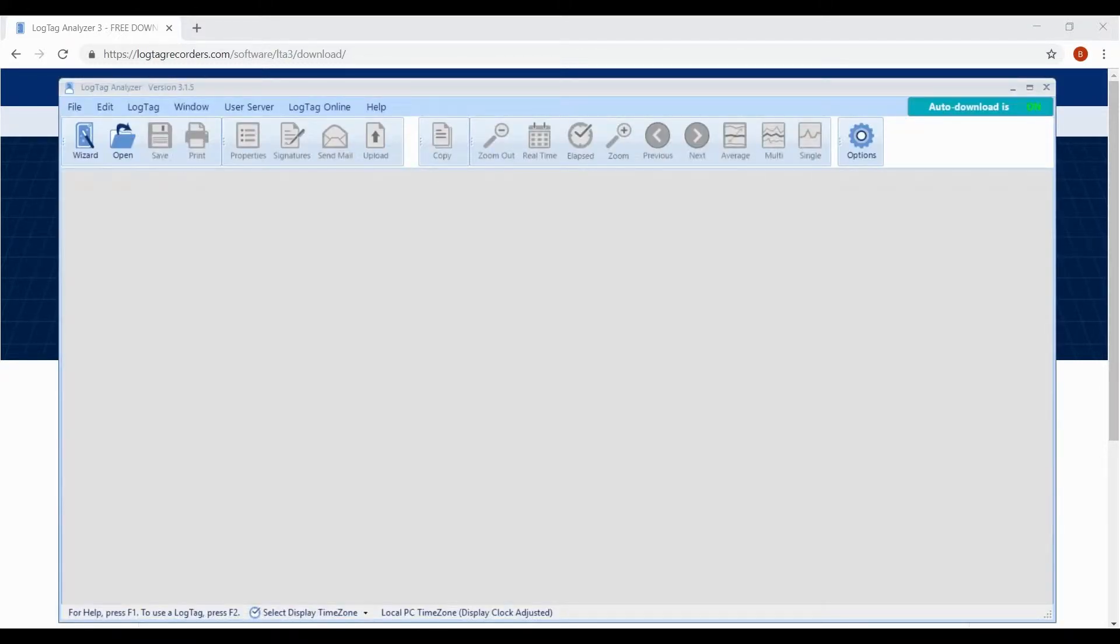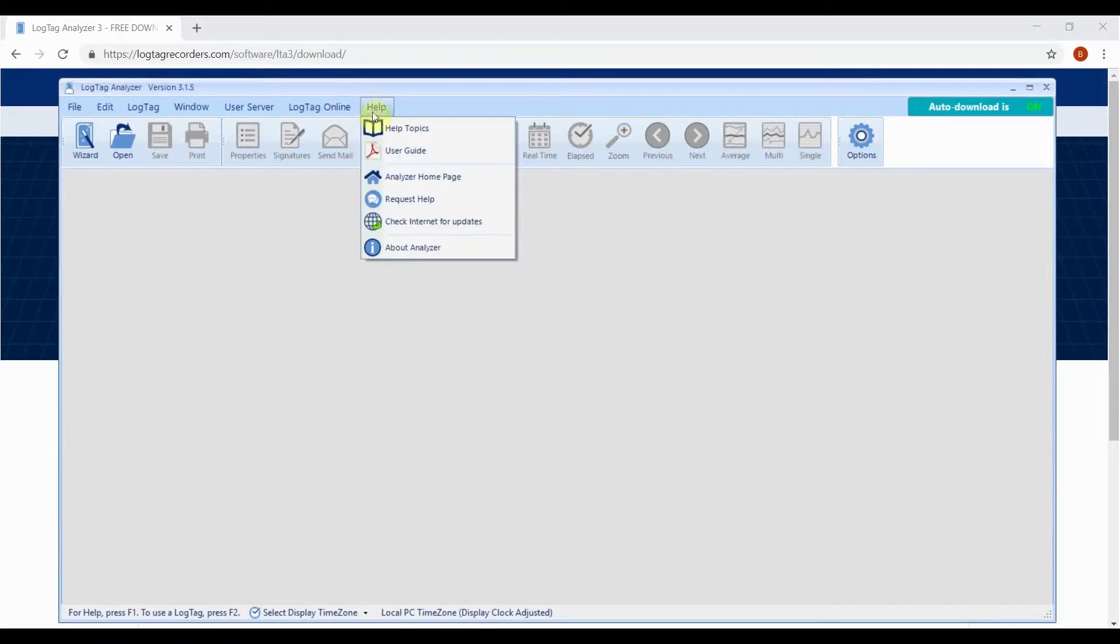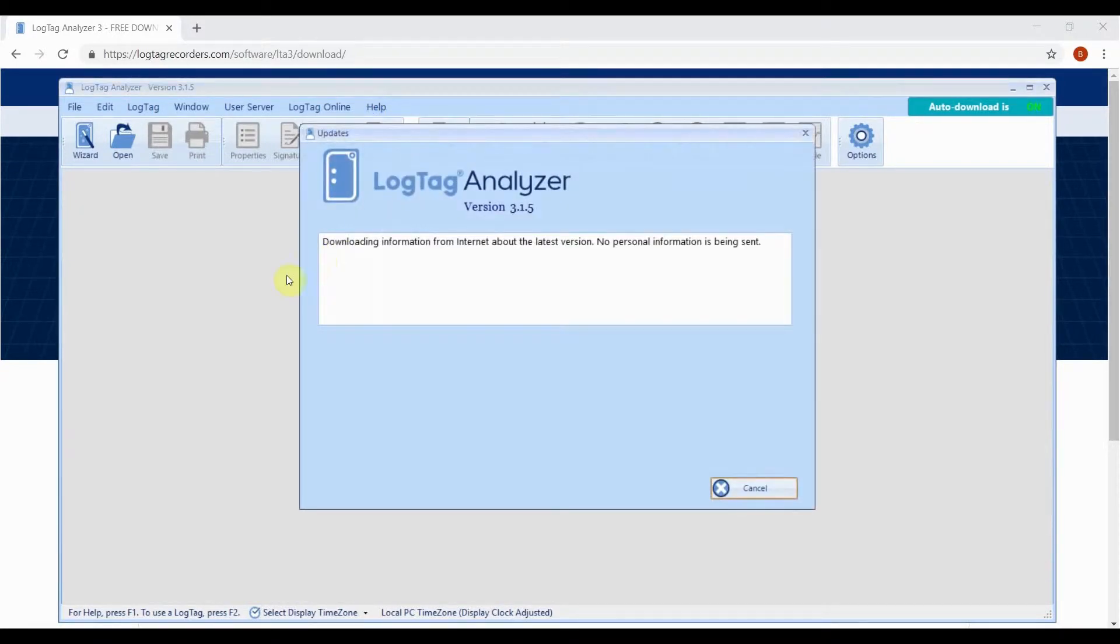If you already have the software installed, we strongly recommend updating now to the latest version of LogTag Analyzer 3 to ensure full support of our latest products.